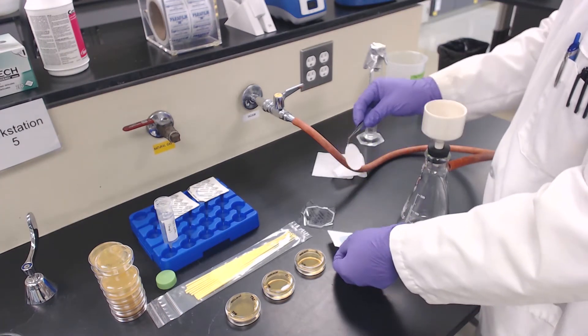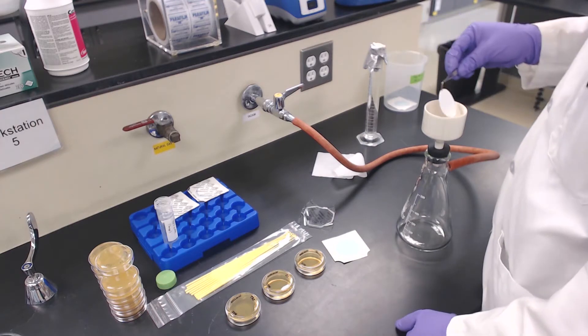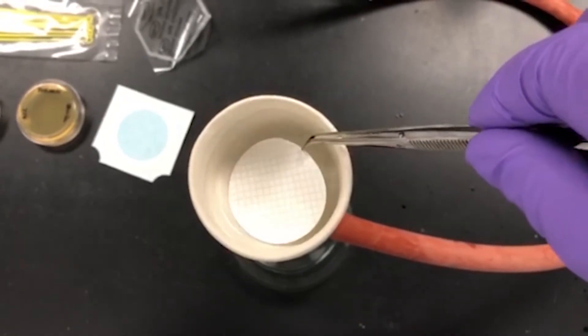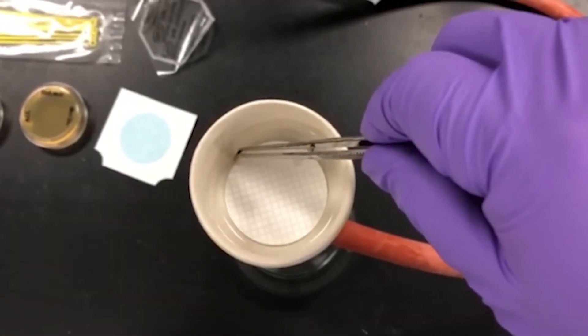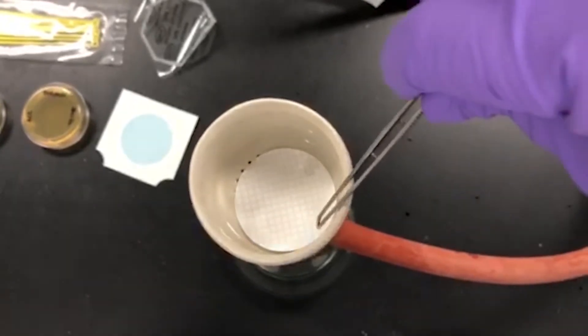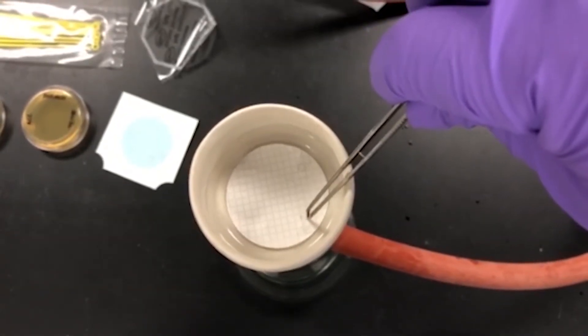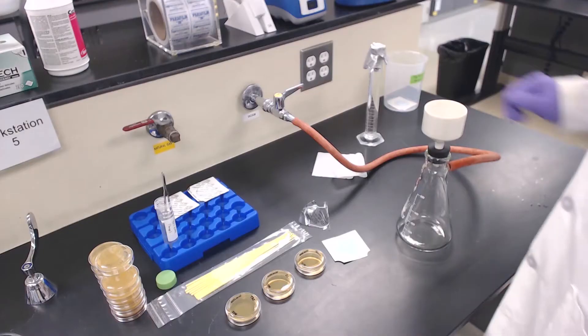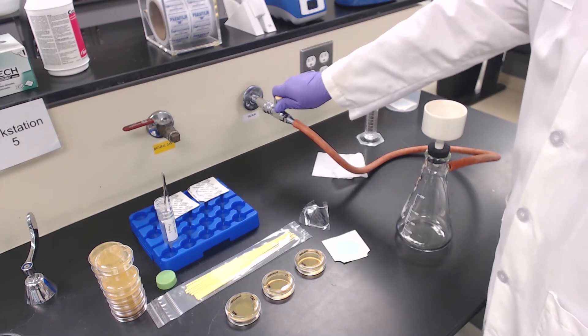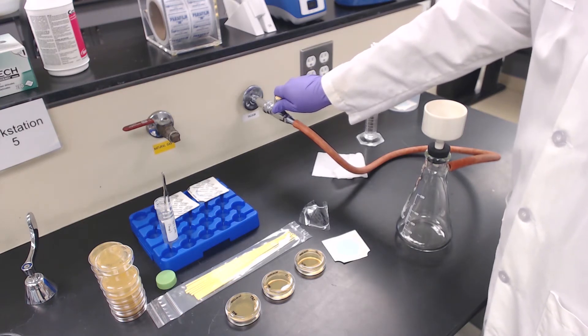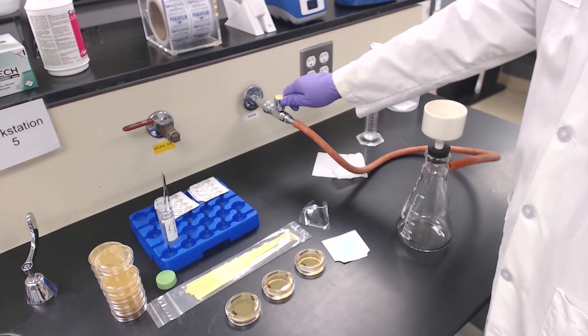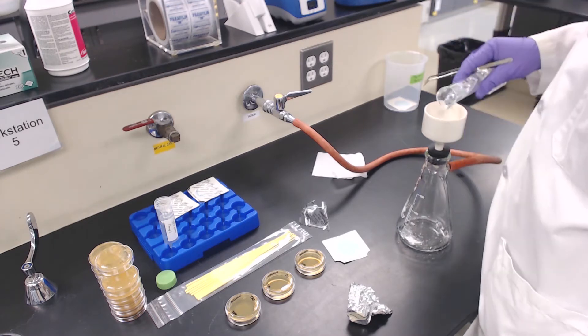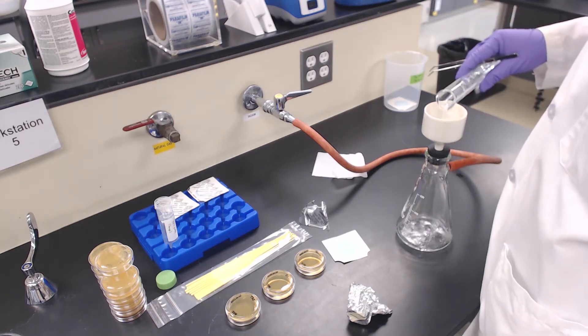Begin processing the first sample. Place a new sterile gridded filter paper in the Buchner funnel. Ensure that when you place the filter in the funnel it covers the filter holes. If any holes are showing, use the forceps to realign it in the center of the funnel. Slowly turn on the vacuum. Do not filter with the vacuum at maximum setting. Filter all 100 milliliters of your sample.